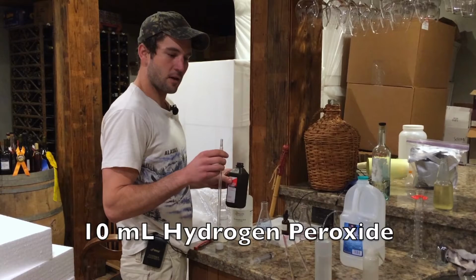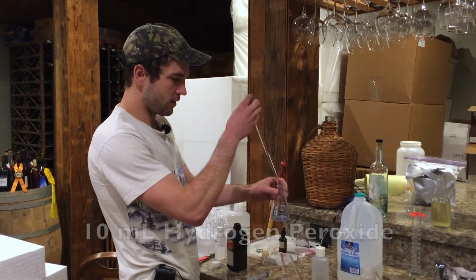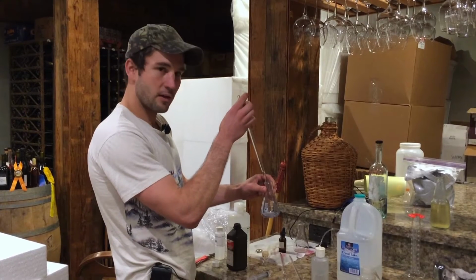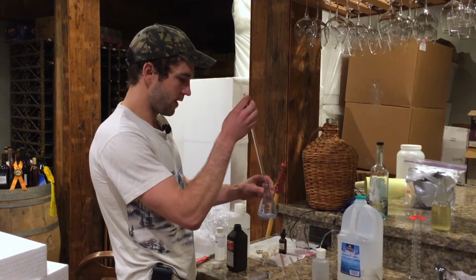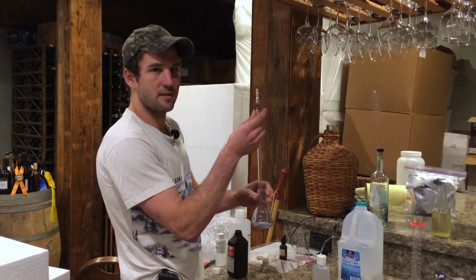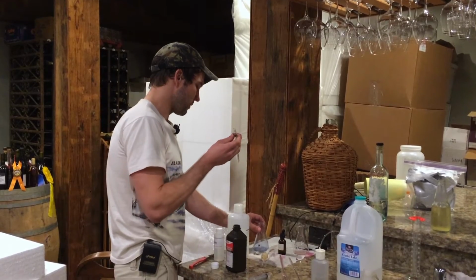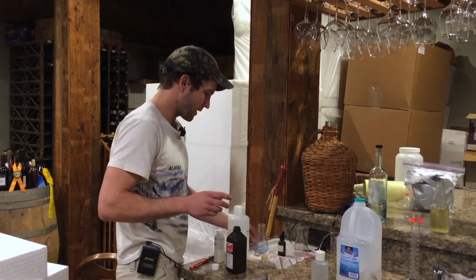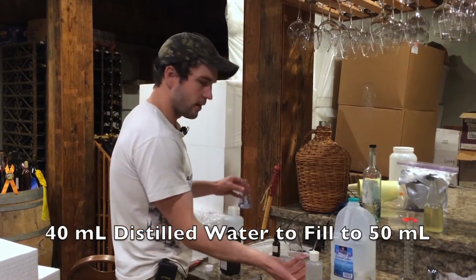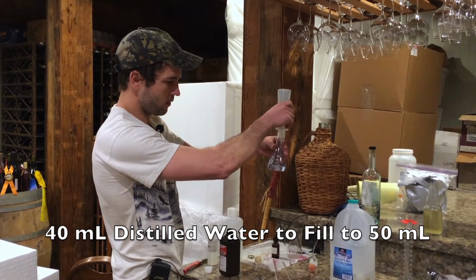So first step is grab 10 milliliters of hydrogen peroxide. One thing that's really important when you're doing the SO2 testing is keep your hydrogen peroxide pipettes and flasks separate from your other ones, because you can cross-contaminate pretty easily. So you can see I got this one marked with duct tape, I got this one marked with duct tape, just so I know that that's what I'm using for my hydrogen peroxide. So I got 10 milliliters of hydrogen peroxide in there. Now I'm going to fill it up to about 50 milliliters total of water.